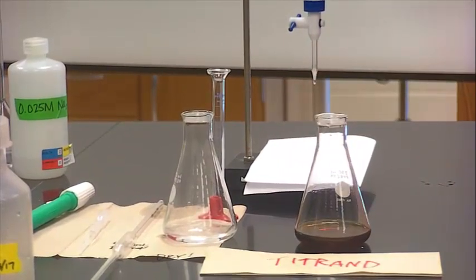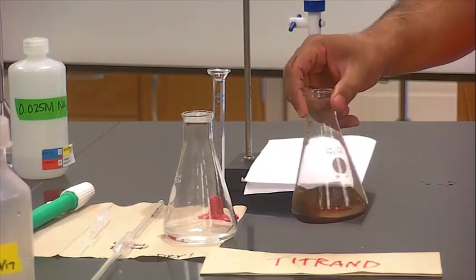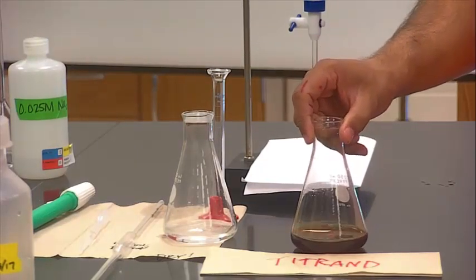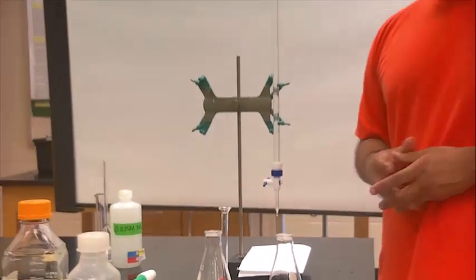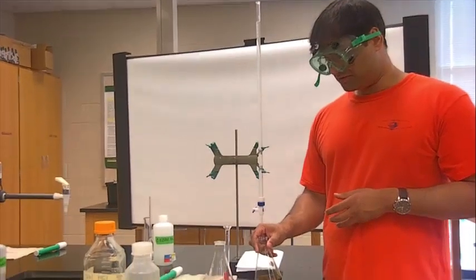the first titration is what we will call the approximate titration. Here, you will just add 1 mil of your S2O3 minus titrant. You just add it 1 mil at a time, in 1 mil increments, and you'll get a rough approximation of your equivalence point, where the color of this disappears.